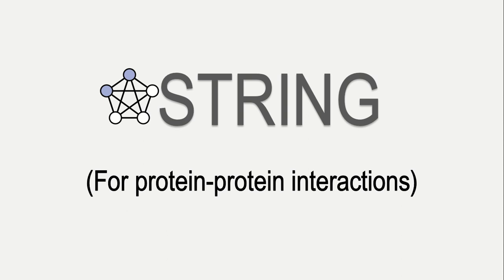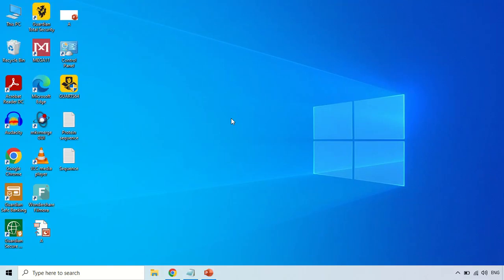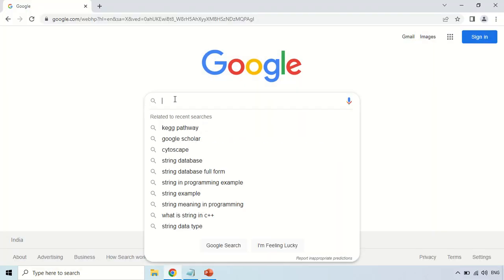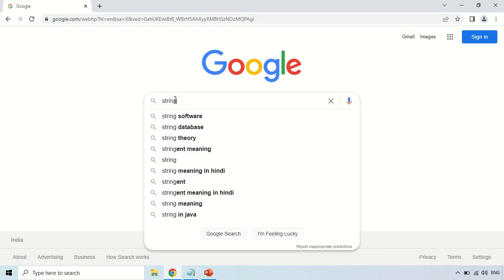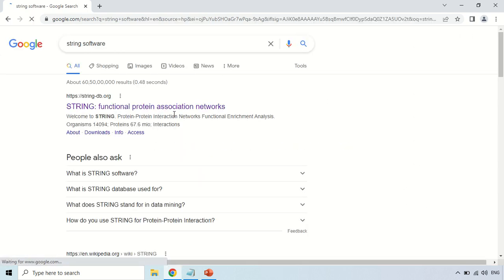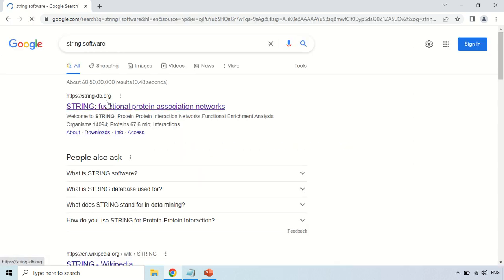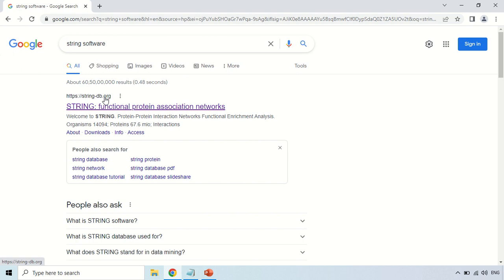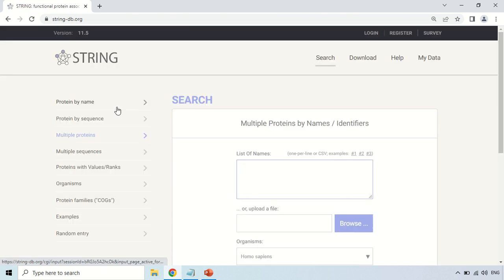In order to use the STRING tool, just open your browser and search for the STRING software. As you search, the first website that appears, stringdb.org, is the main website. Just click here, and this is the homepage of the STRING tool.